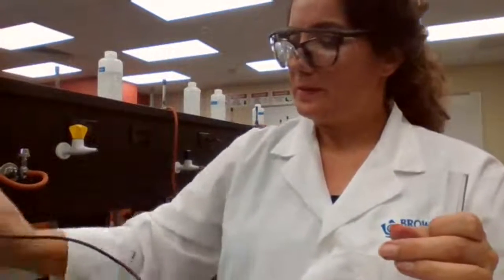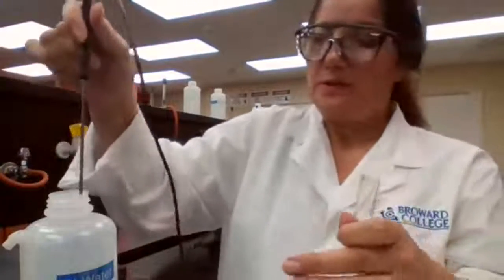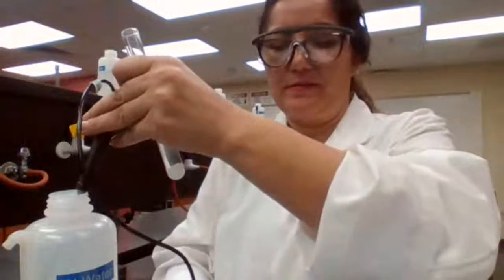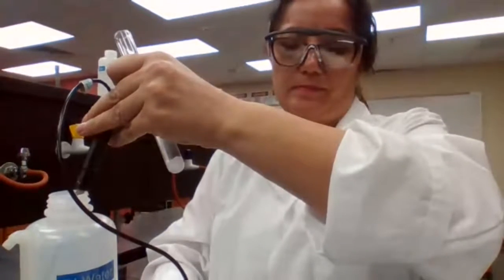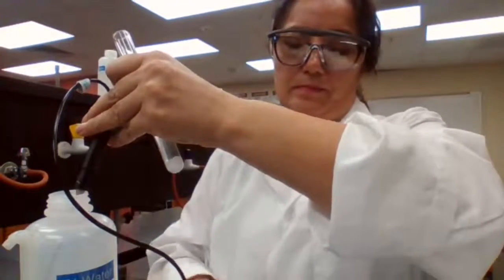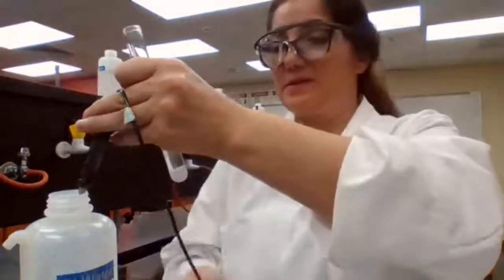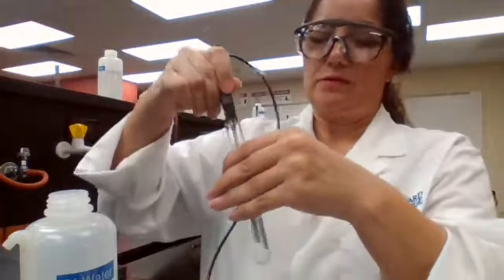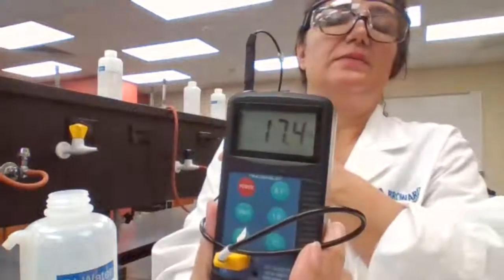The temperature of the water, deionized water, is 24 degrees Celsius, close to 25. The temperature of the solution is 17.4, down from 23.7 degrees Celsius.